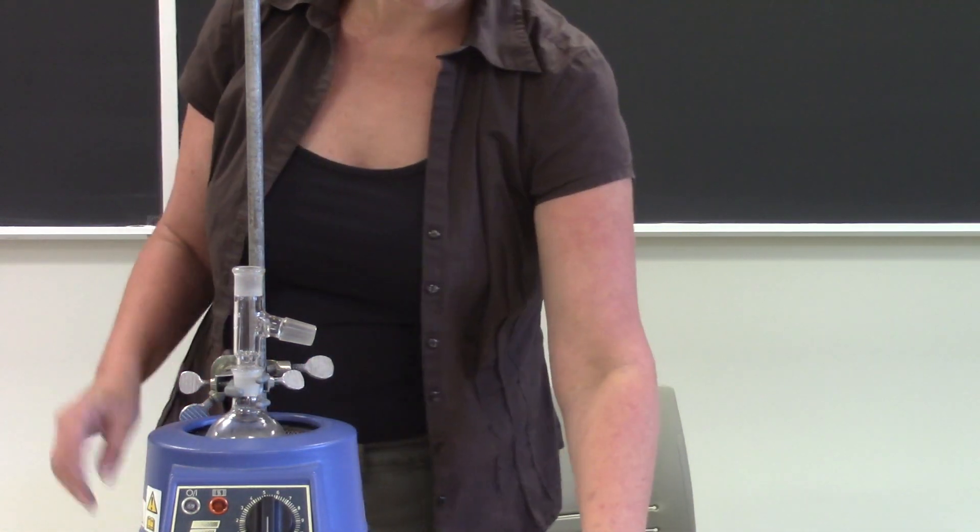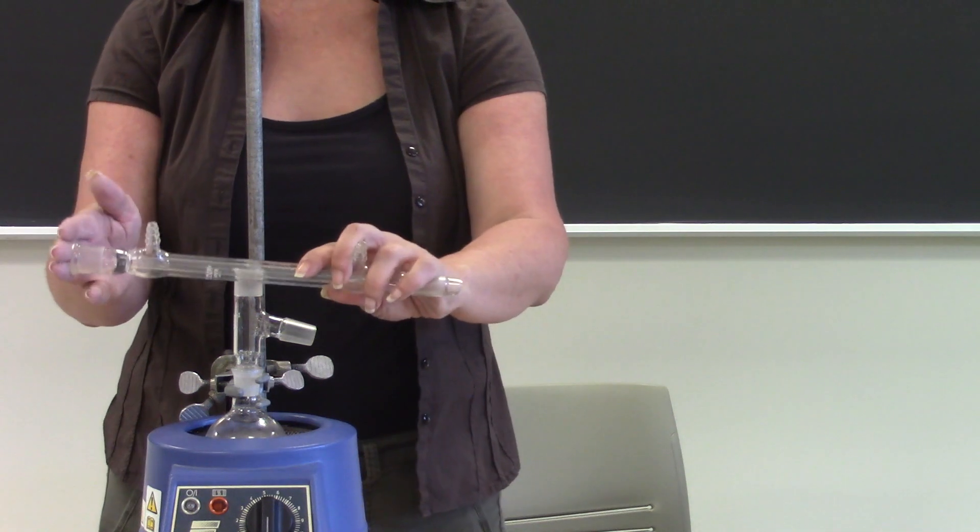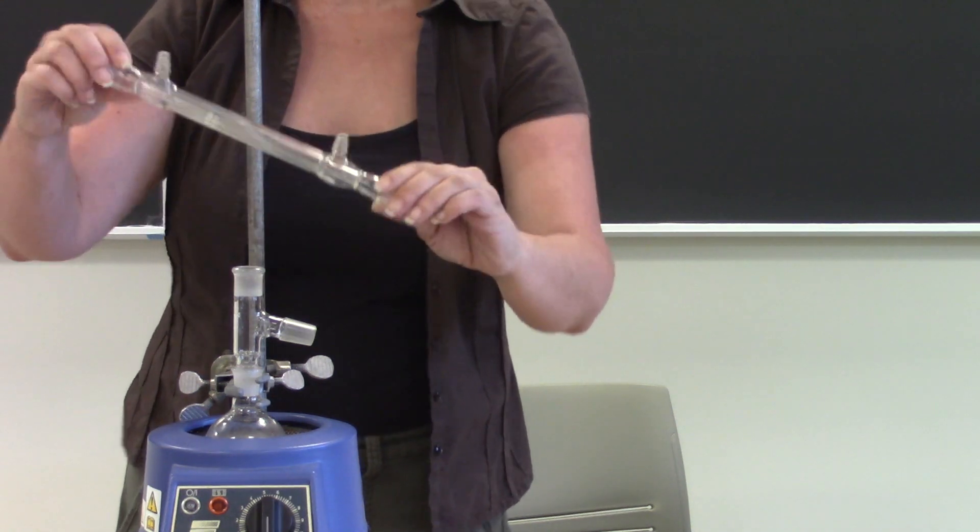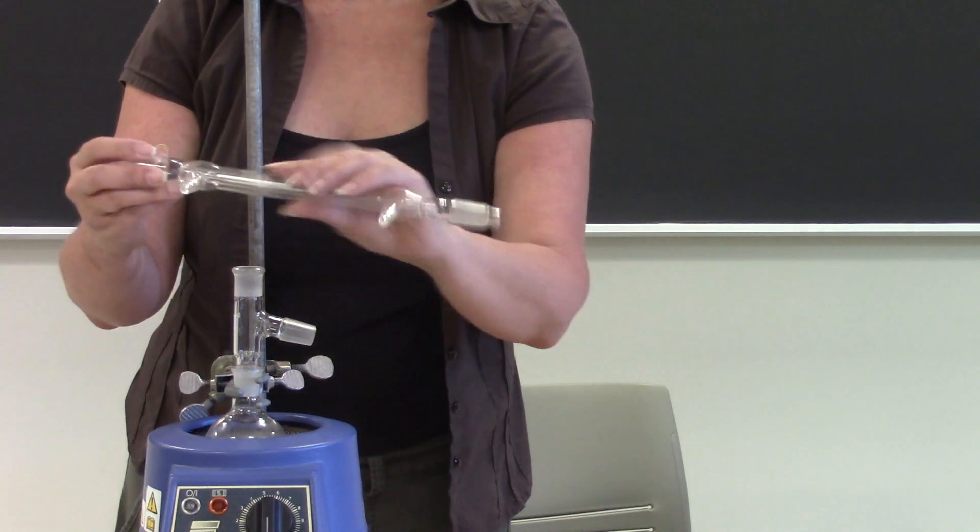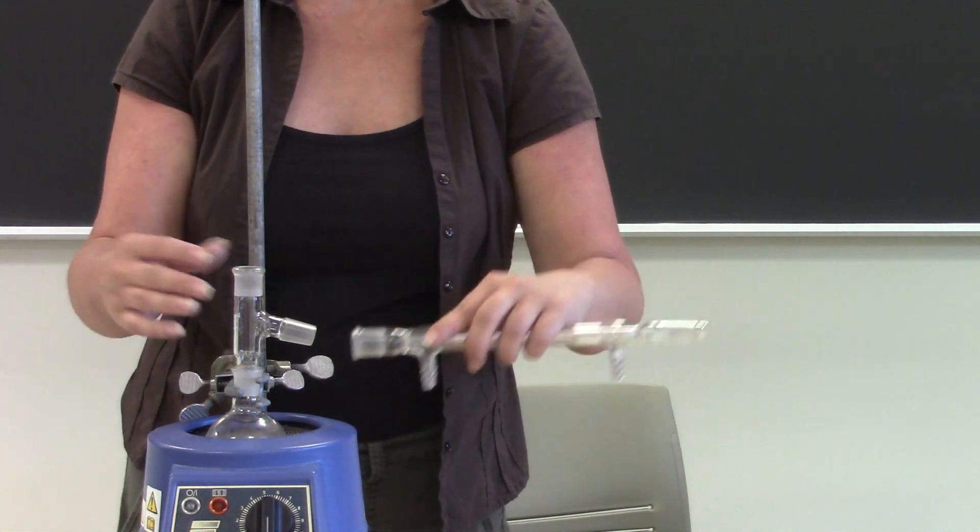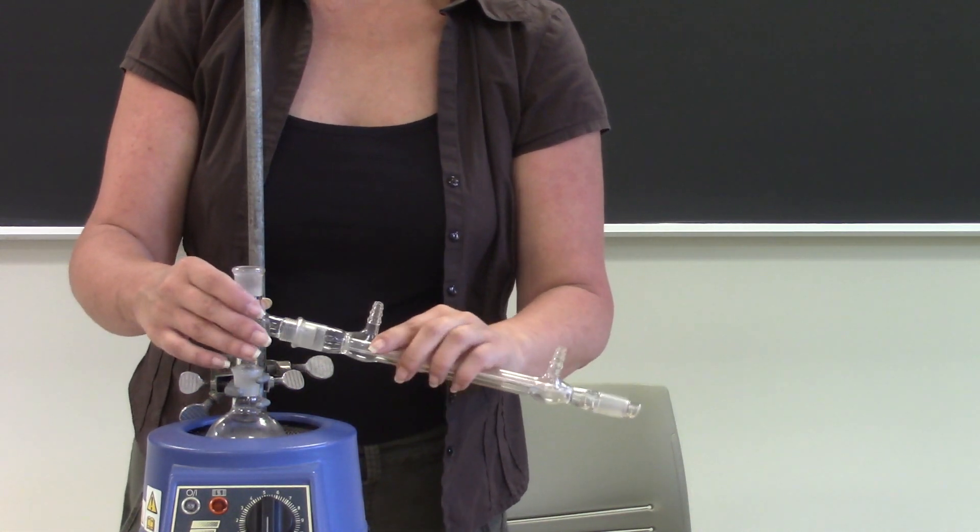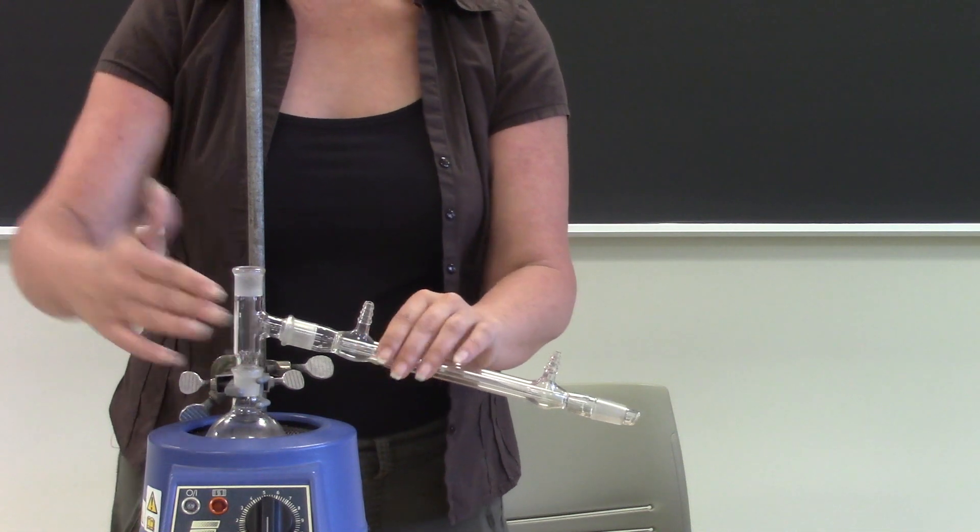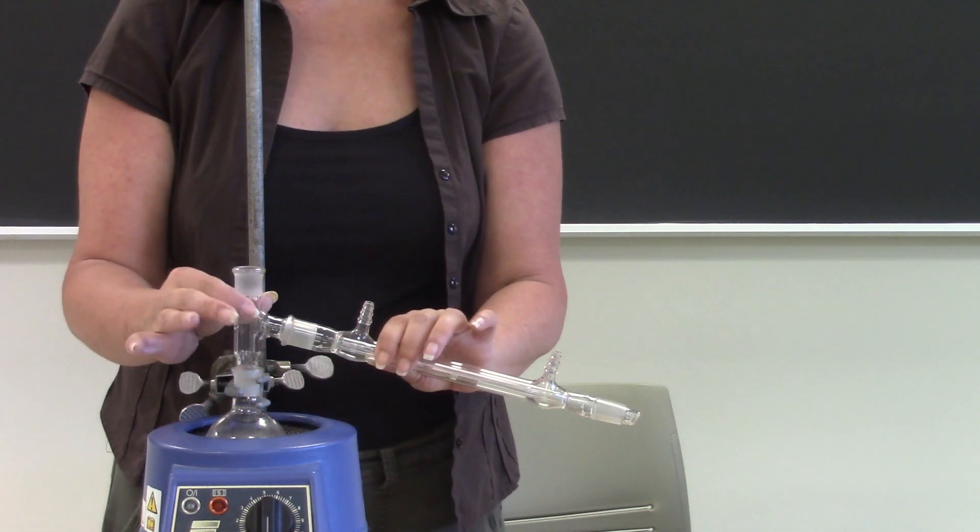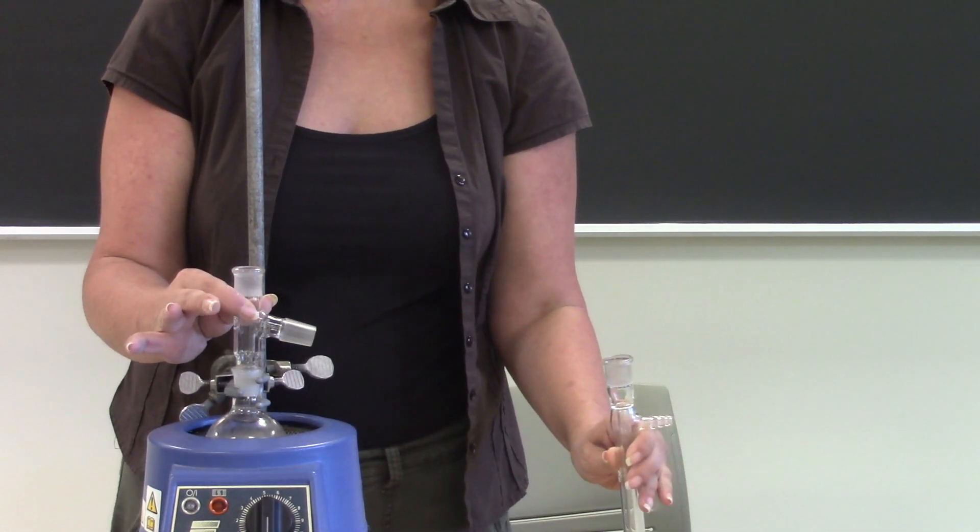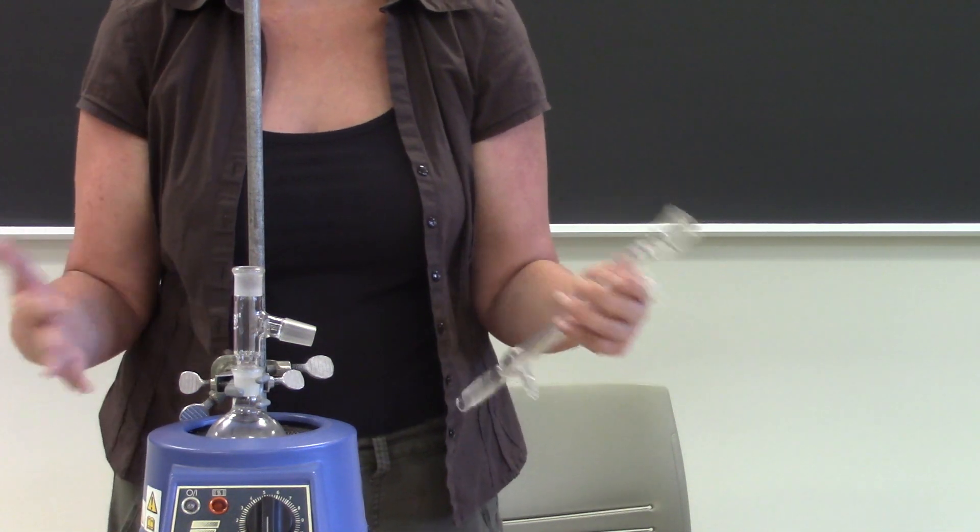The next thing that you are going to attach is your condenser, so this is where the vapor is going to be collected and condensed. So this goes on here but if you notice it's coming off at a downward angle which means during your distillation it could easily fall off and break and that's kind of a bad day in chemistry.